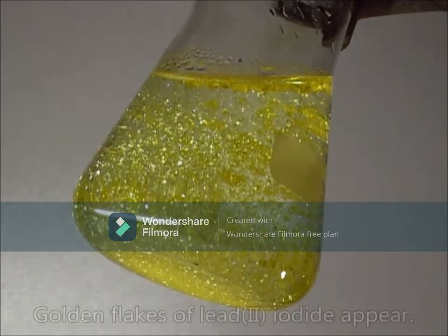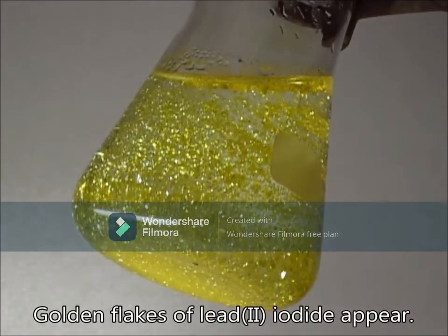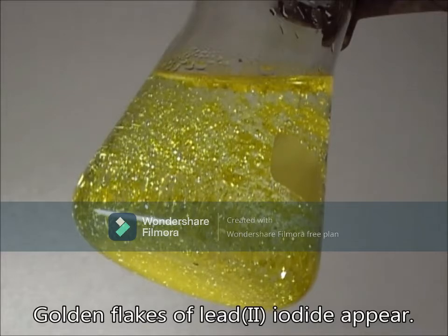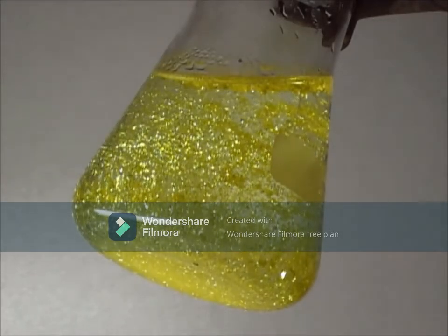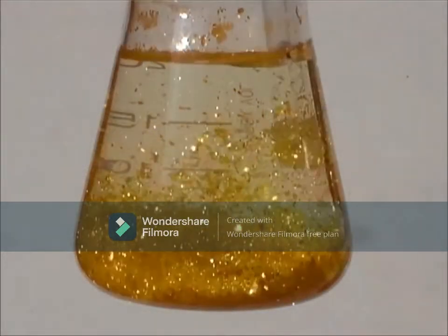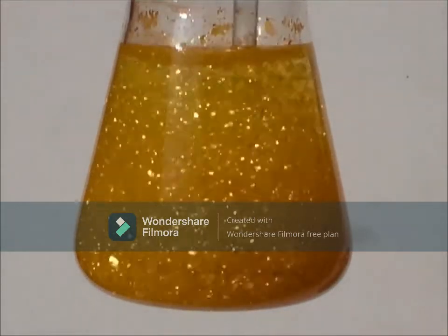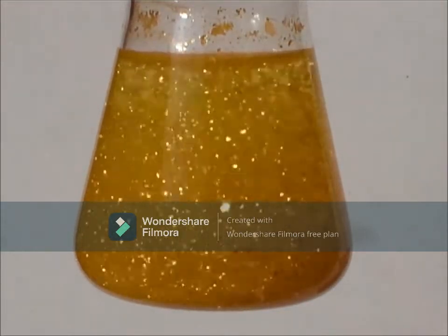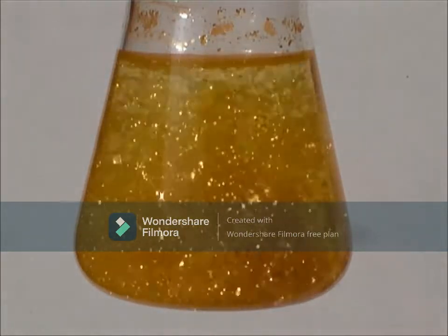The chemical reaction involved is precipitation, and the physical process that forms these crystals is called crystallization, where golden flakes of lead-2 iodide were forming. It looked like glitter to you, however, this cannot be used because lead is a toxic metal and shouldn't be used by consumers like us.